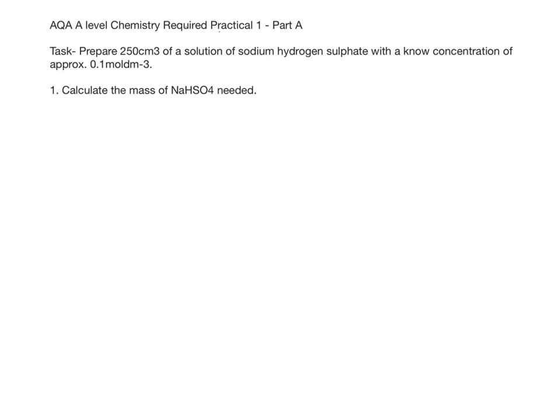To do this, we start by working out the number of moles using volume times concentration. The volume is 250cm³, but it needs to be in dm³, so divide by 1000. The concentration is 0.1, which gives 0.025 moles.